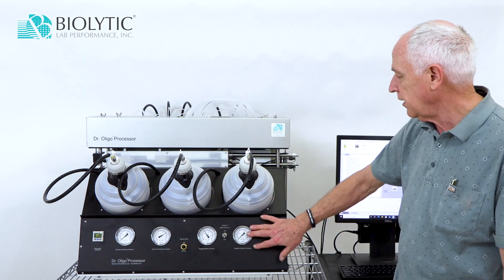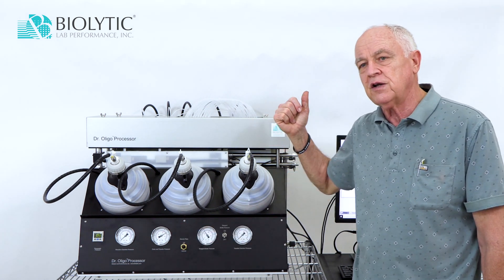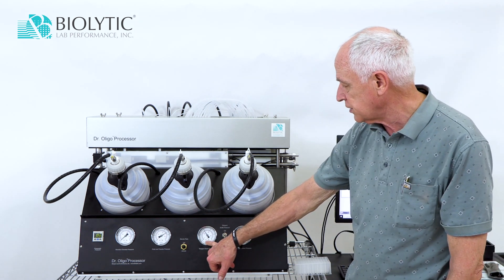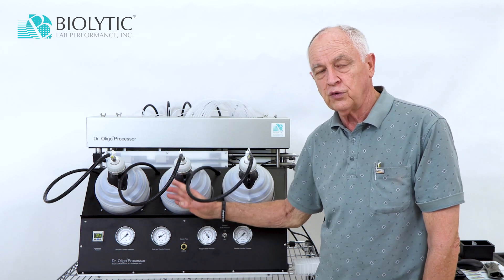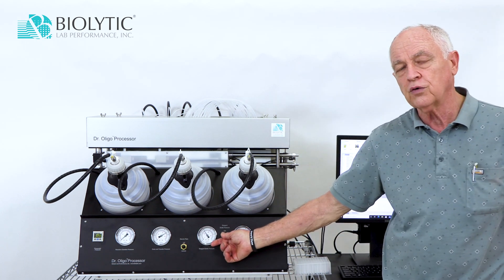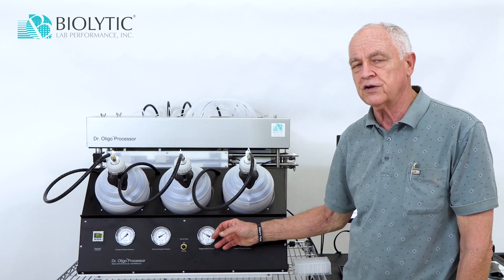On this side, we have a pressure — this same pressure is being used to pressurize what we call a transfer station where we can transfer oligos from a deep well plate into the cartridges. We also have our bottle pressure. Reagents move from the bottle to the location where we need it — the columns — using pressure. This is the pressure applied to the bottle and this is the control for that pressure, so if we want to refill bottles we can turn this off, and when operating we turn it on to pressurize the bottles.